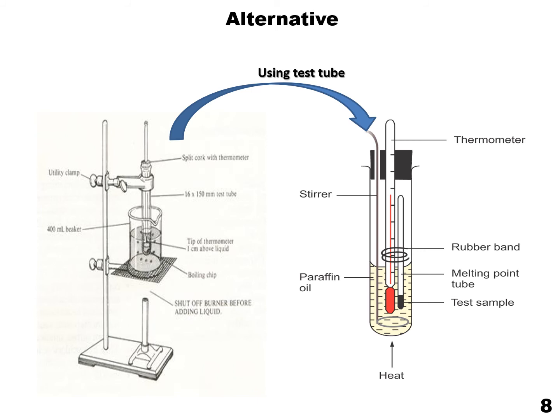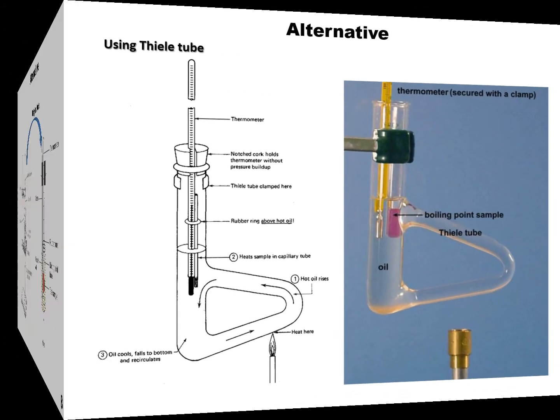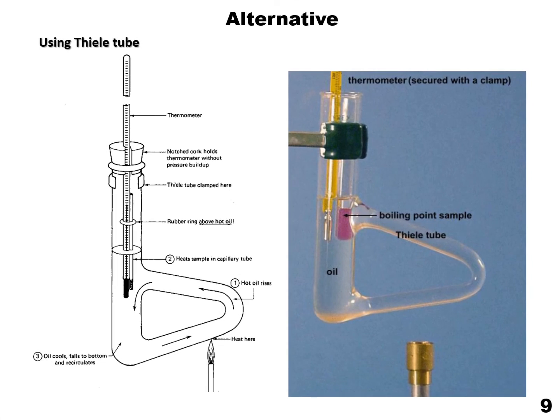We do have another technique of doing the melting point experiment with the Thiele tube, and the operation is similar.